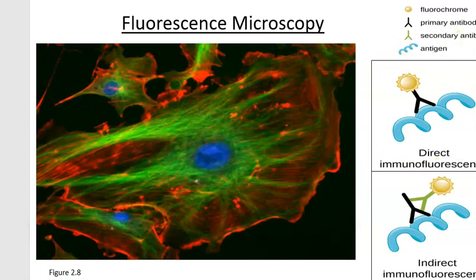And if you look at this little picture, there's your little specimen, this little spring-like thing. And you can actually take an antibody with a fluorescent molecule attached to it, and the antibody sticks to your specimen. And that way, when you shine UV light, this thing is going to give off that visible light that we can then see on our microscope. So really nice.